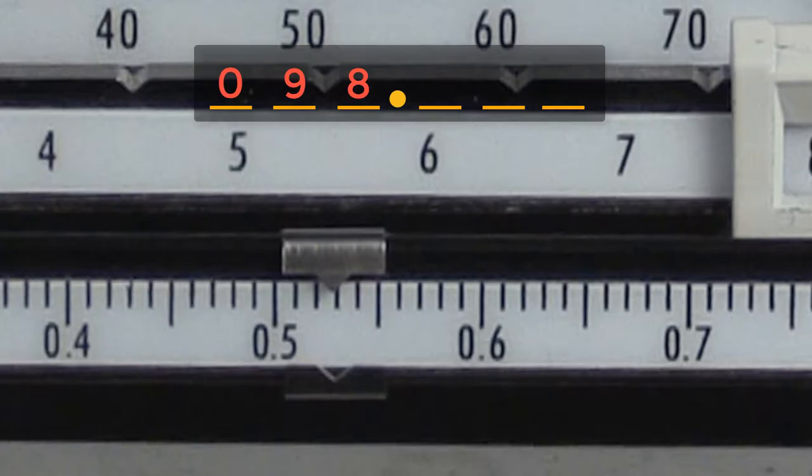Zooming in, we can see that on the tenths beam, the slider is reading somewhere between 0.5 and 0.6. So we can add the five to the tenths place in our measurement.